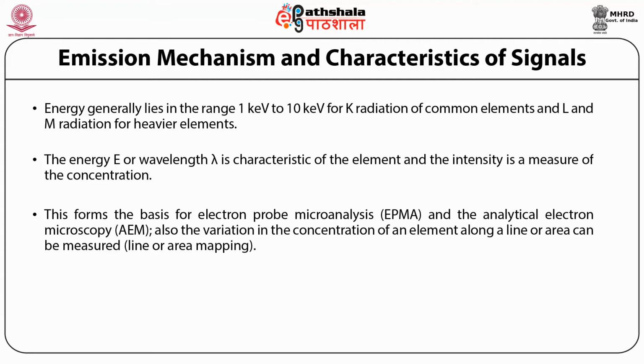Also, the variation in the concentration of an element along a line or area can be measured, which is called line or area mapping.